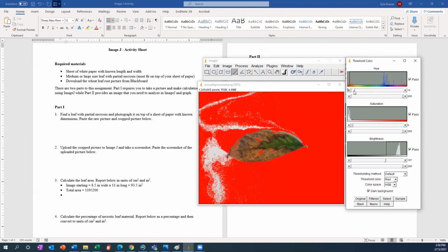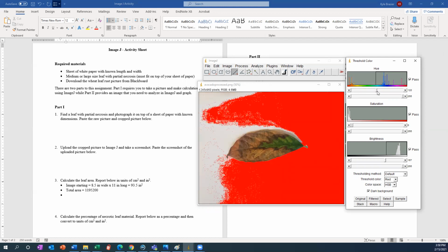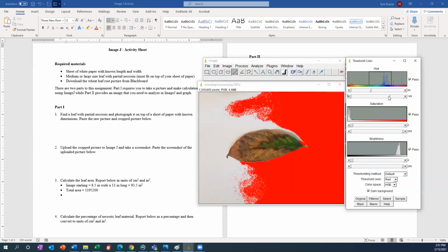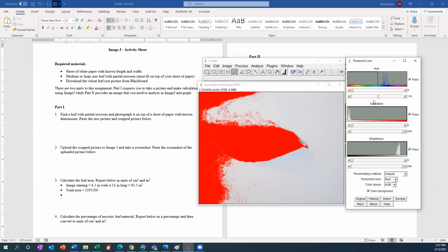Well, how do we do that? Let's kind of click around a little bit here, see what we get. If we do something like that, maybe we see that if we do this, this is tricky, isn't it? How do we get this to work? So I recommend spending a little bit of time on this. It's not necessarily as easy as you might hope. Let's see.